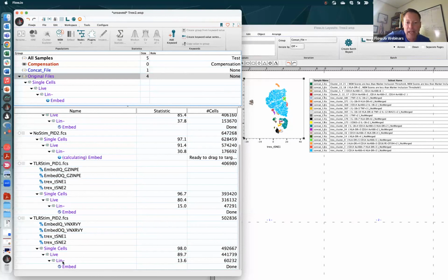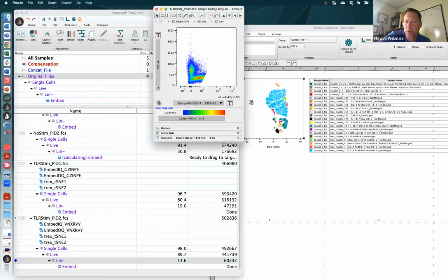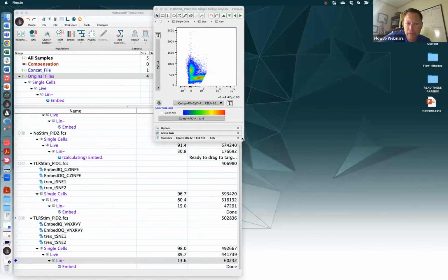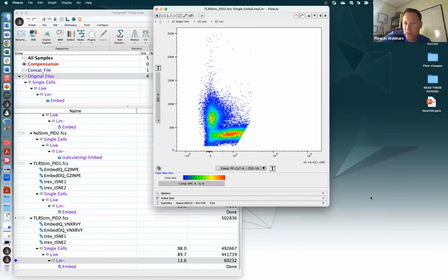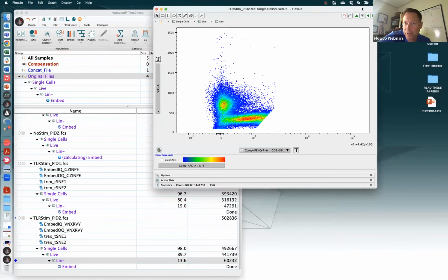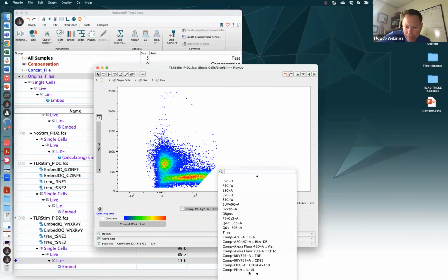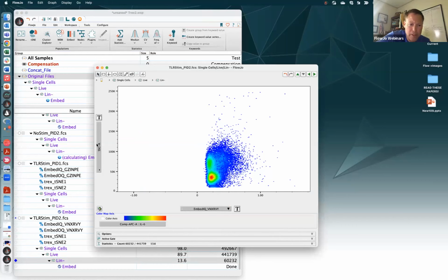Nice. I can go to the lin negative population over here. I want to minimize the screen. There, stretch this out beyond my zoom controls so that I can move it. There we go. And let's do input quality and output quality just to see what that looks like.